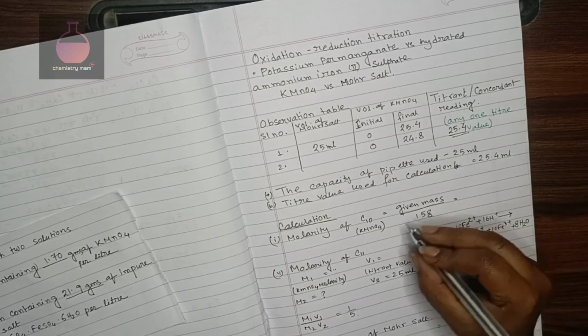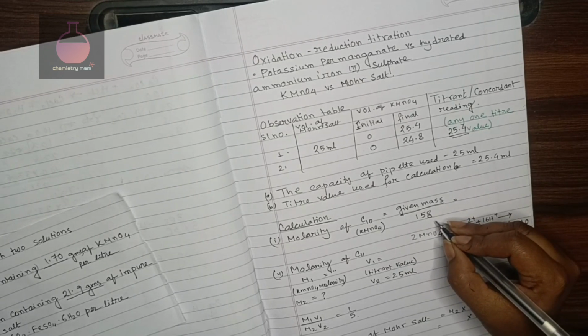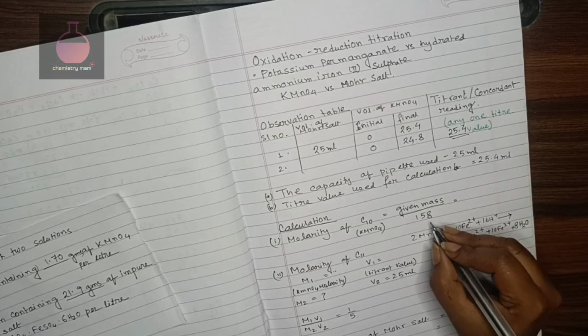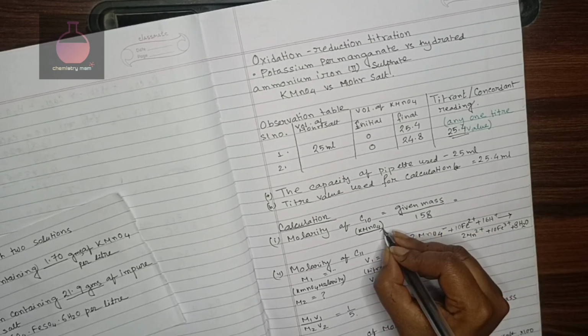So my first answer I will write like this: molarity of C10 = given mass by 158. Now you can ask from where this 158 is coming. 158 is the molecular mass of KMnO4.